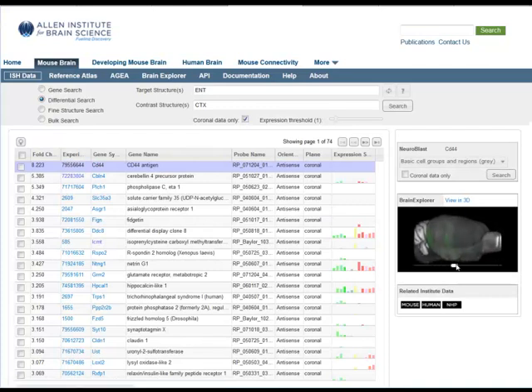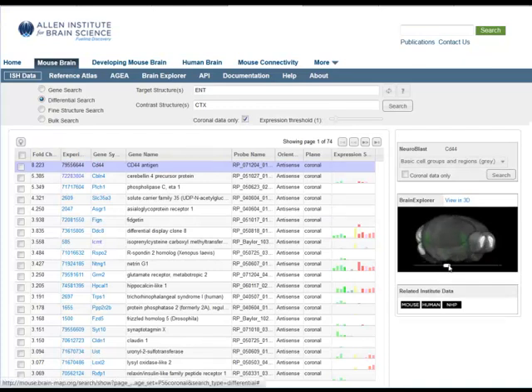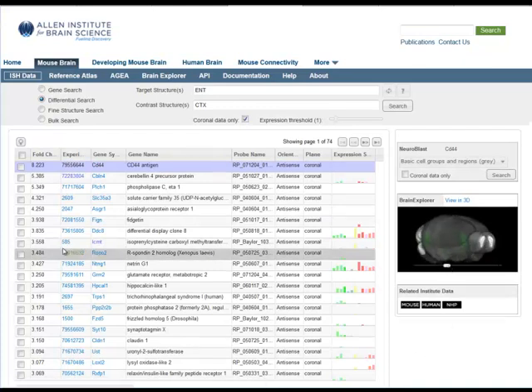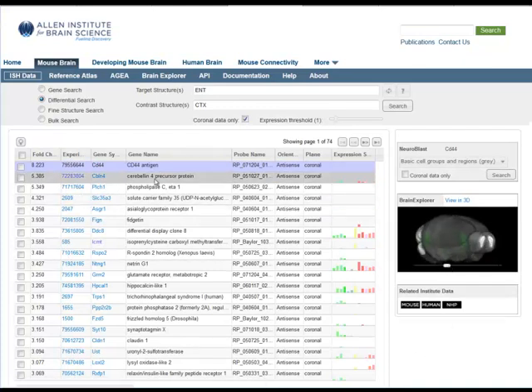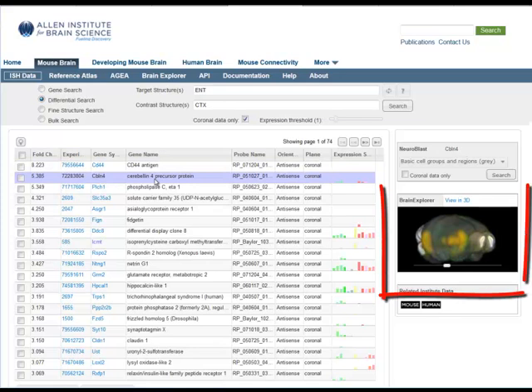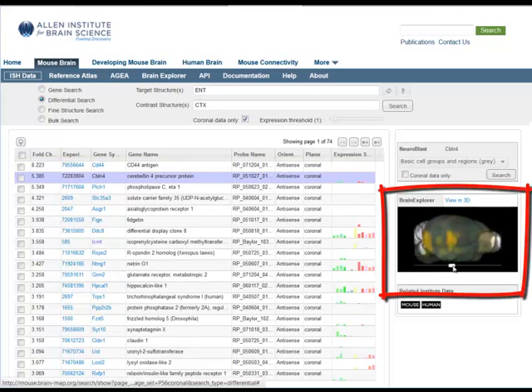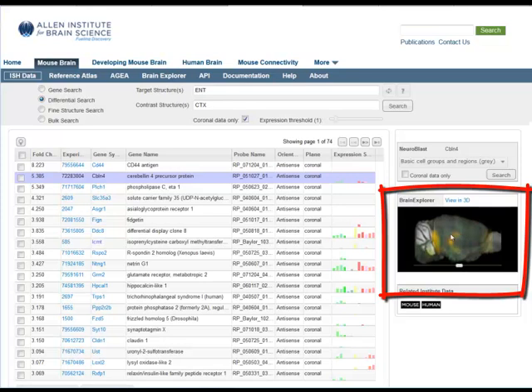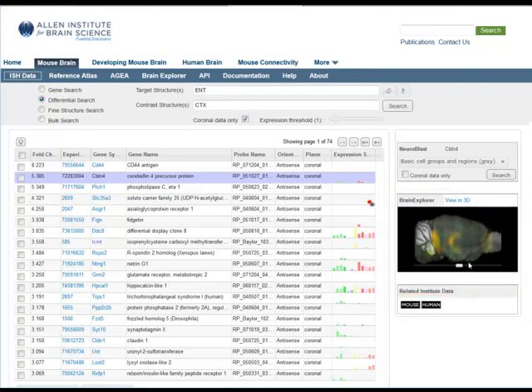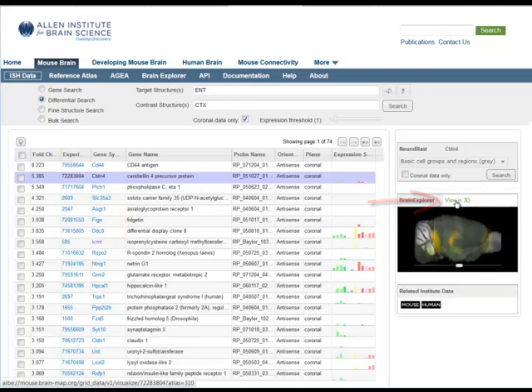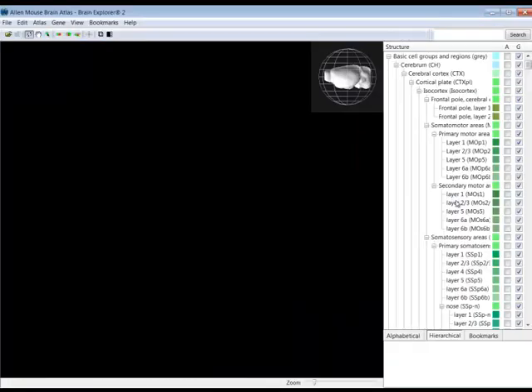You can browse this list by clicking on the gene name, which will bring up a three-dimensional thumbnail view of the experiments. Once you find a gene that shows an interesting gene expression profile, like CBLN4, click the View in 3D link above the thumbnail viewer, and you will be taken to the Brain Explorer software.